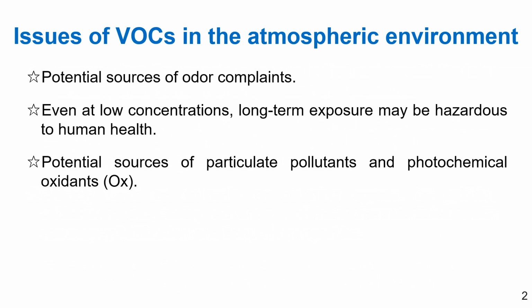Issues that emitted VOCs cause to the atmospheric environment are presented here. First, some VOCs have a specific odor and their improper use can cause complaints. Second, few VOCs have acute toxicity, but some VOCs may be harmful to human health due to long-term exposure, even at low concentrations.